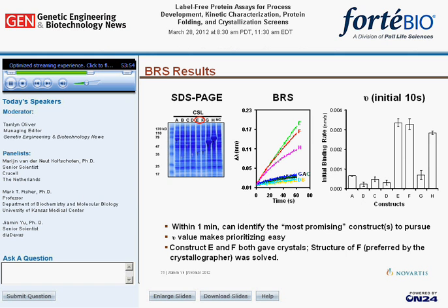If you want to figure out why the other constructs weren't ranked high, you can always run a gel to do additional analysis, such as analytical sizing. However, if you don't have the time, at least you know what would be a good choice to scale up first. Next slide.